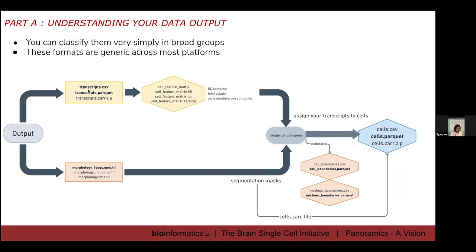What I've done is I've taken these 23 files on your right and I've split them up into these broad groups. Basically your output has got your gene expression files, you have your images, and you have your transcripts file. They've given you transcripts.csv, transcripts.parquet, and transcripts.zarr. There's nothing to be afraid of these extensions; they're just different formats.